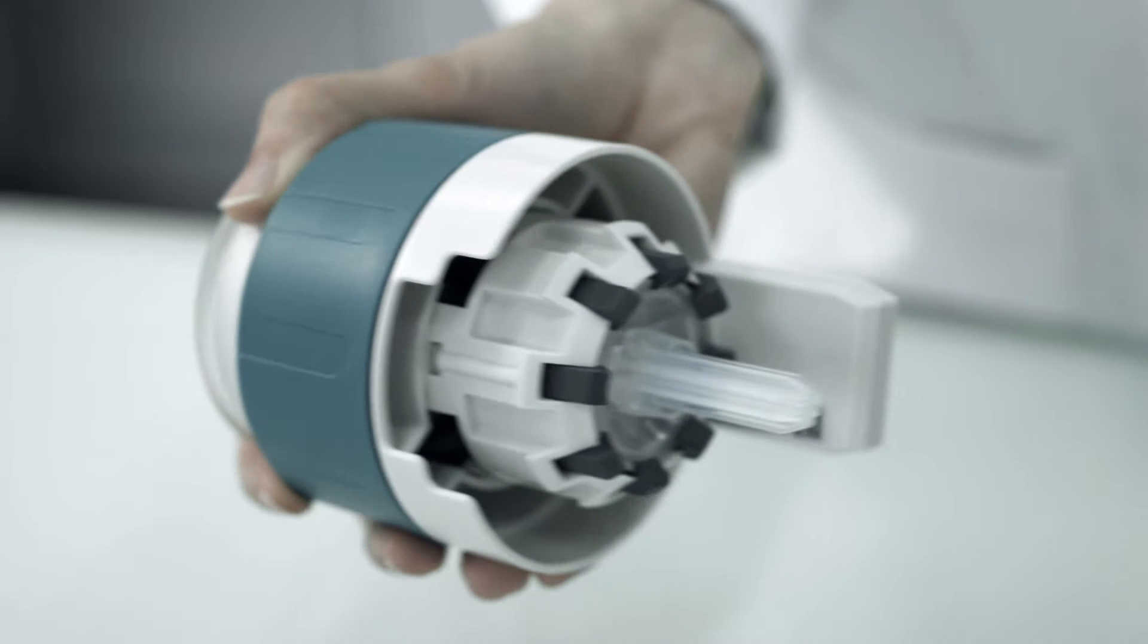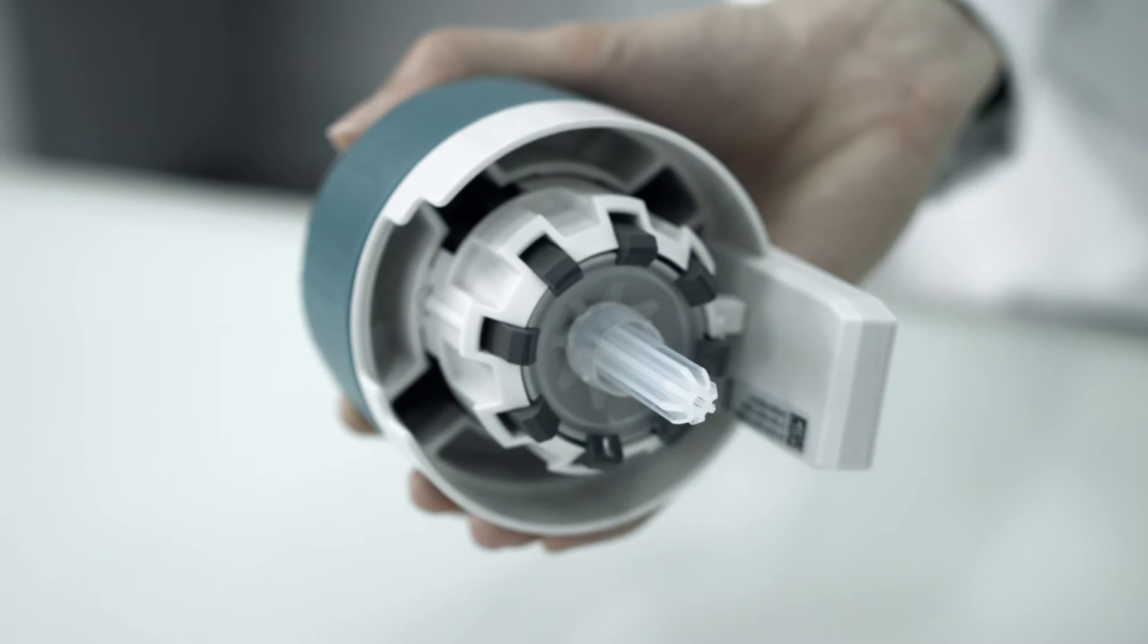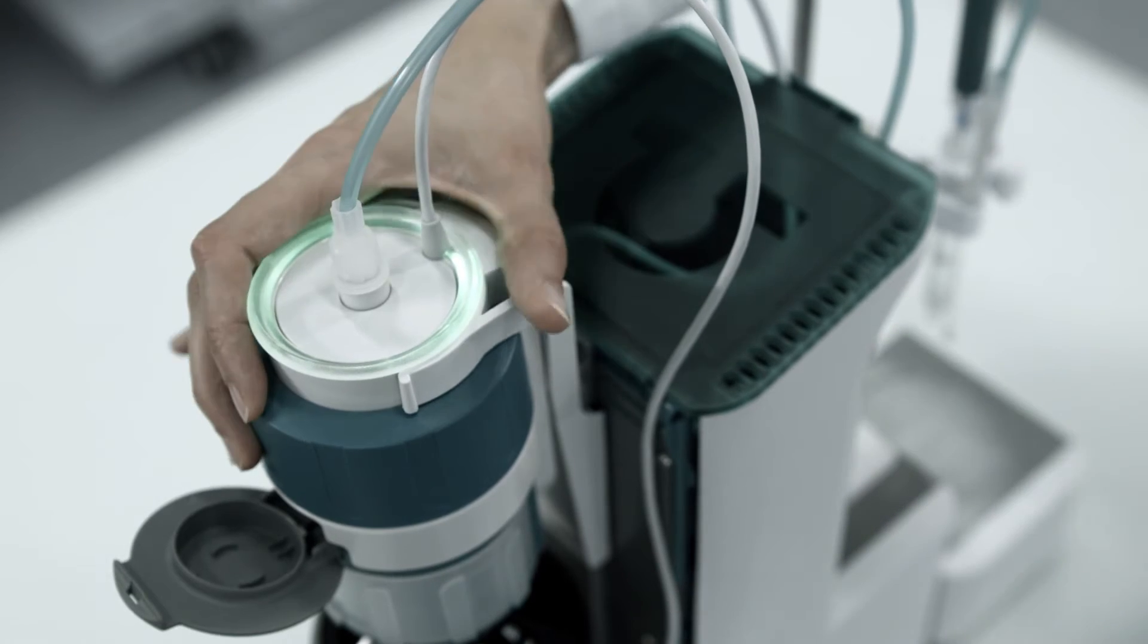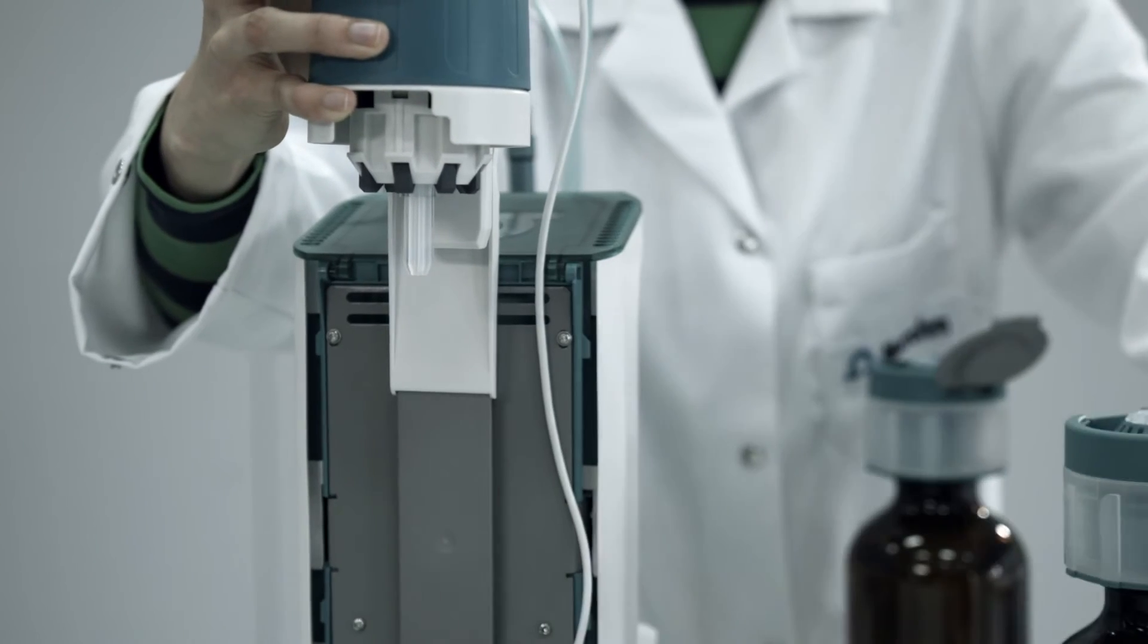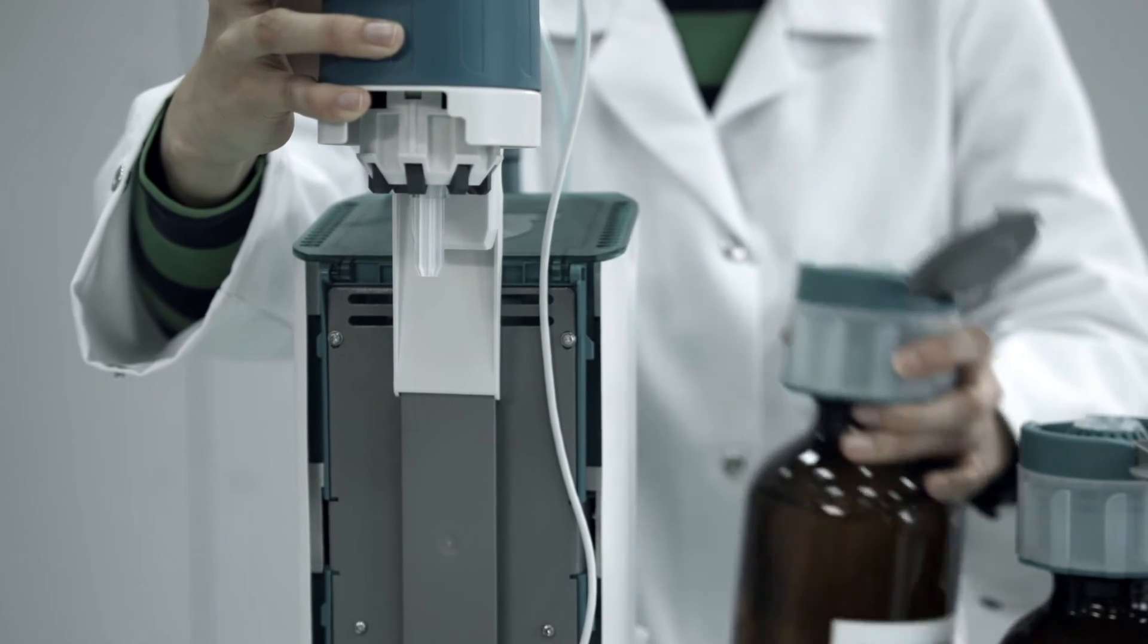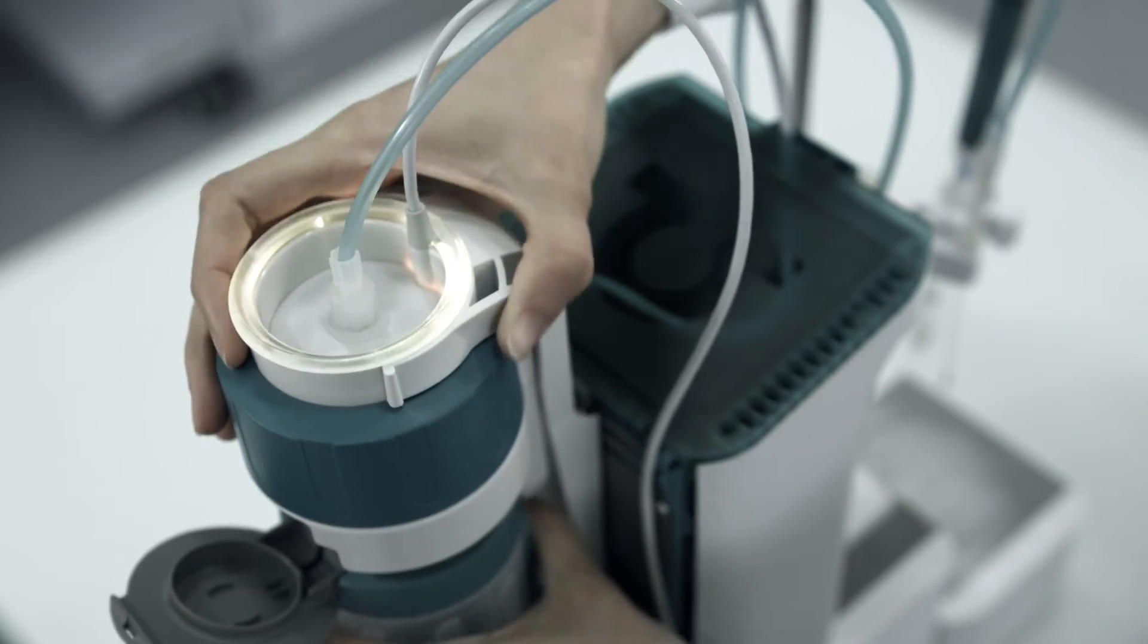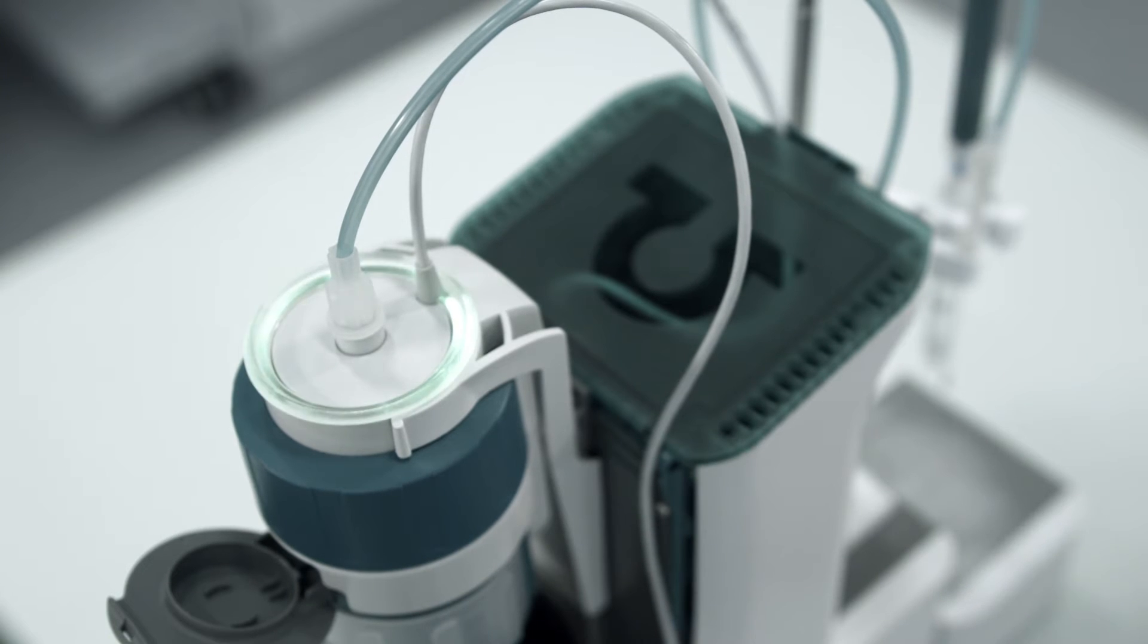Handling this adapter system is simple, safe and fast. Simply remove the liquid adapter from the empty reagent bottle. Open the lid of the bottle cap on the new reagent bottle. Finally, snap the liquid adapter onto the new reagent bottle. That's it.